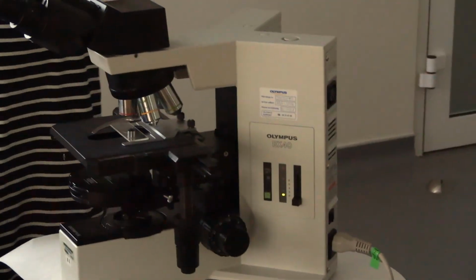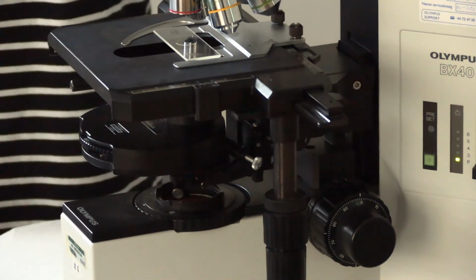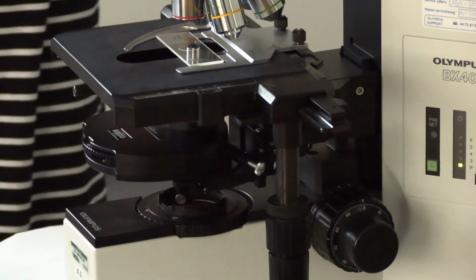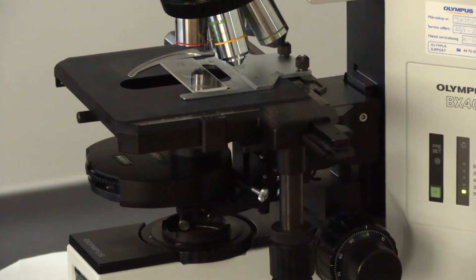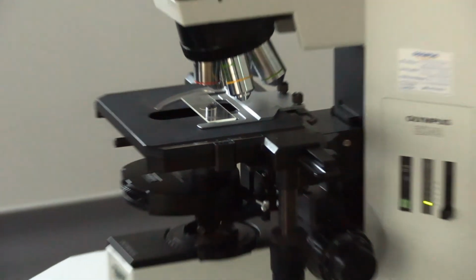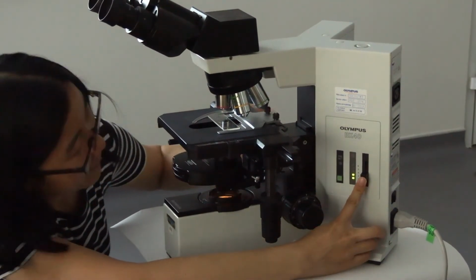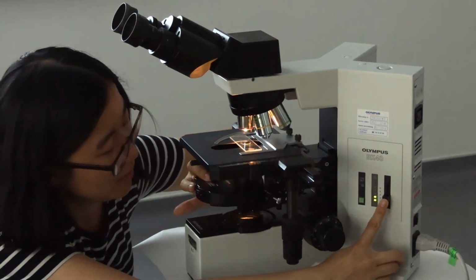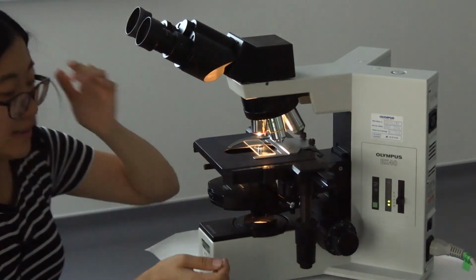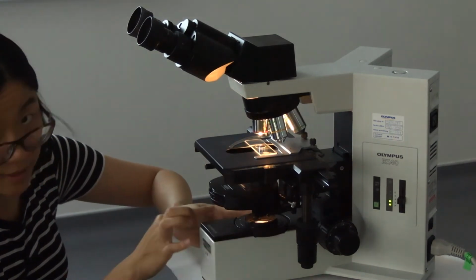So I will also show you a little bit how to adjust it, especially when you remove this condenser and try to rearrange, try to input back again, then you need to fix everything. So first, again, let's increase a little bit the light, then it's easier for you to see the light happens. So increase a bit the light and turn the iris to the largest.